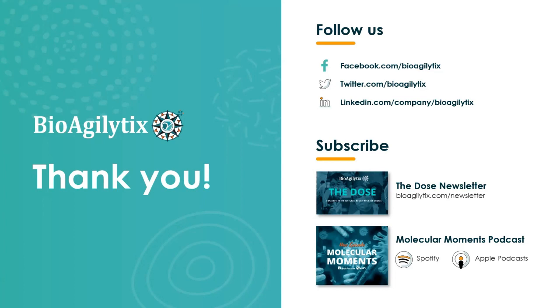Thank you. The next question is, do you need the same level of sensitivity for a VCN assay for CMC and bioanalytical? Yeah, maybe I'll take a stab at this. Shishin should have mentioned that in the first question, I believe. The level of sensitivity is very dependent on the context of use of that assay, and it could be different in a CMC setting versus a bioanalytical one.